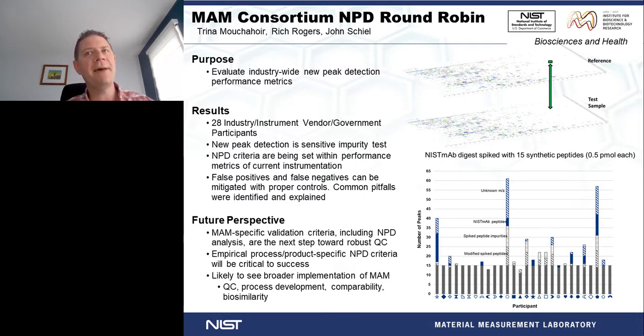So again, this shouldn't have happened in the individual laboratories, but there was an issue with column carryover, incomplete washing of some of the column components or the autosampler components, et cetera, that we were able to identify. And then there were some unknown M over Zs. Some of these were due to water contamination, system contamination, previous samples, et cetera.